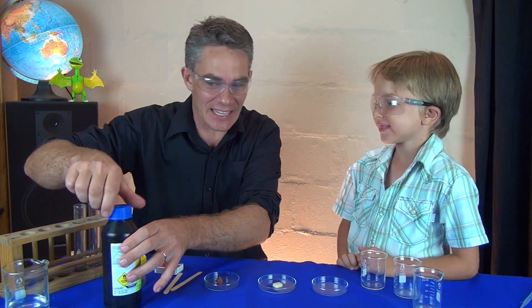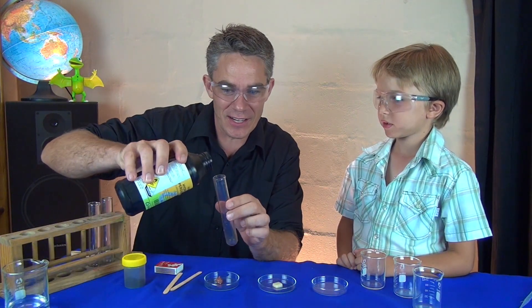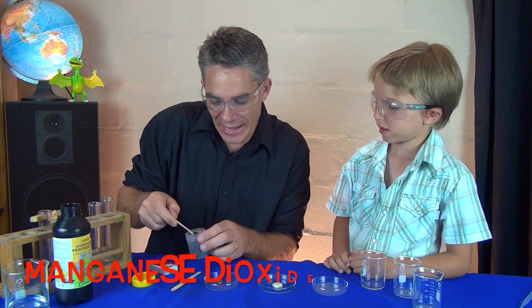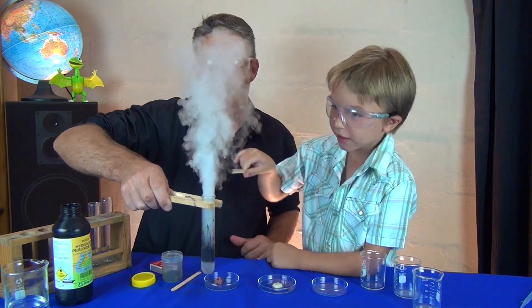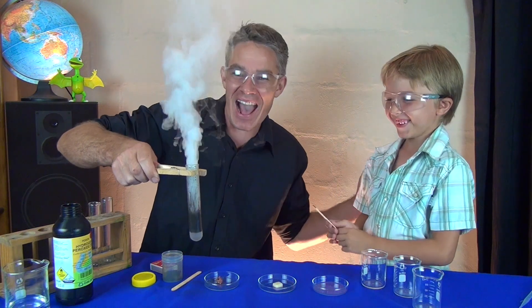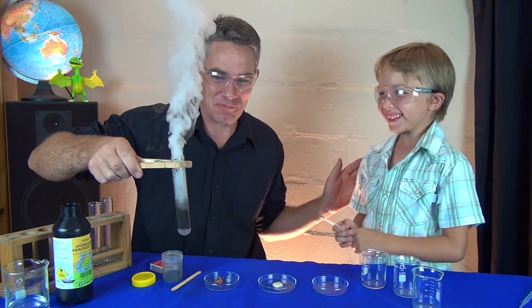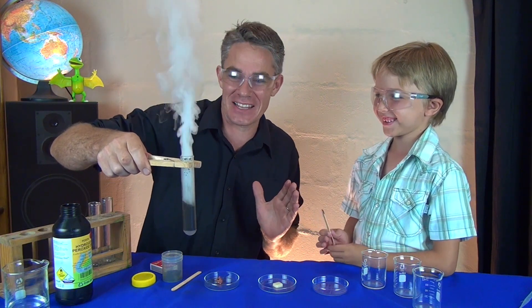A very concentrated chemical here. I put a little bit of hydrogen peroxide in this test tube and you're going to put in a catalyst. Tip it in. Whoa! Look at that Sam. It's like a steam train isn't it?